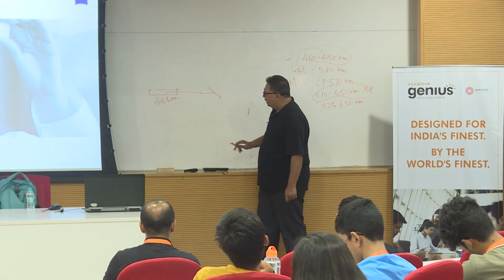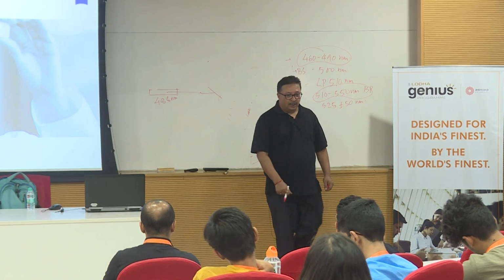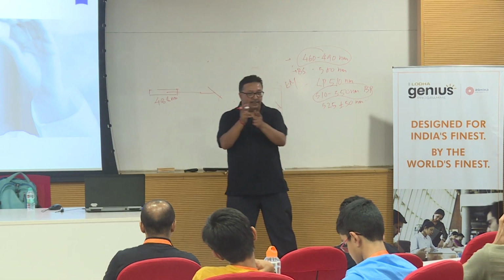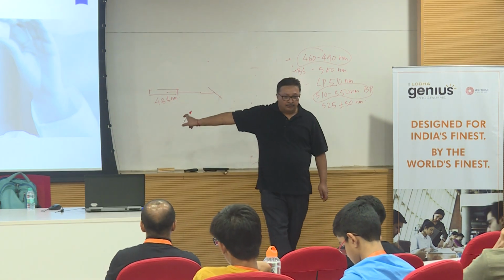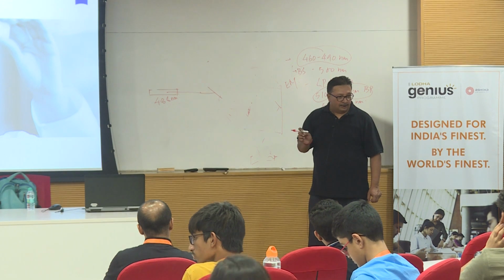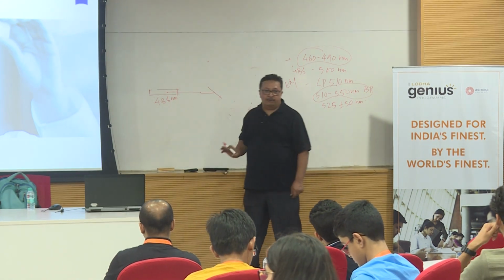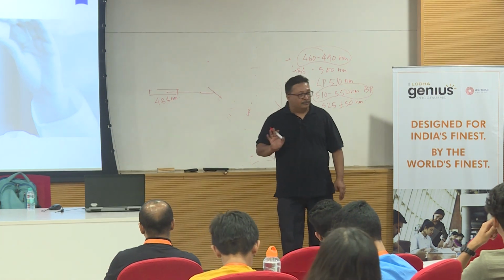And now if you are having a source which is exciting at a particular wavelength, unlike a fluorescence microscope where you have a white light and then you have an excitation mirror. So here, do I need an excitation mirror? Because I am already having a wavelength or a laser exciting at a particular wavelength. So it means that there is no concept of excitation mirror or excitation wavelength to be available onto a confocal.